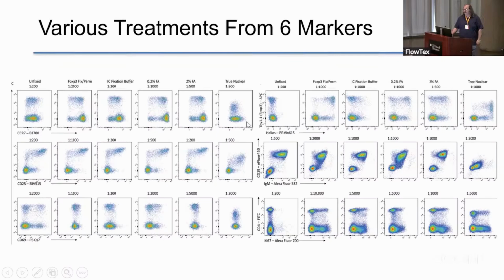I don't really want to go into it, but as you can see, each one of these different treatments has a different optimal titration value that they listed. So for every one that you're seeing up here, they probably did 6 or 8 different titrations or experiments. It's amazing.